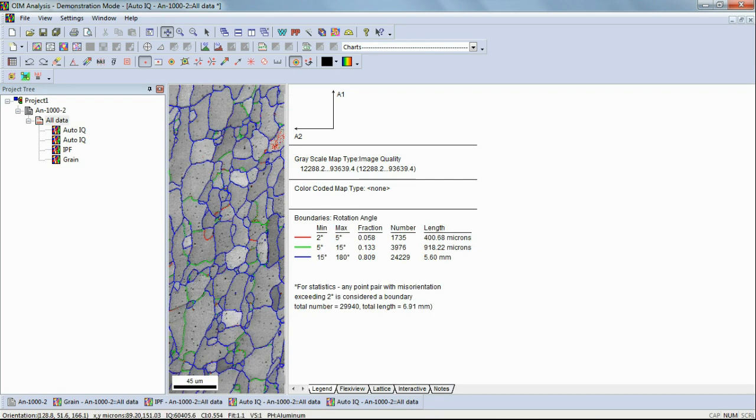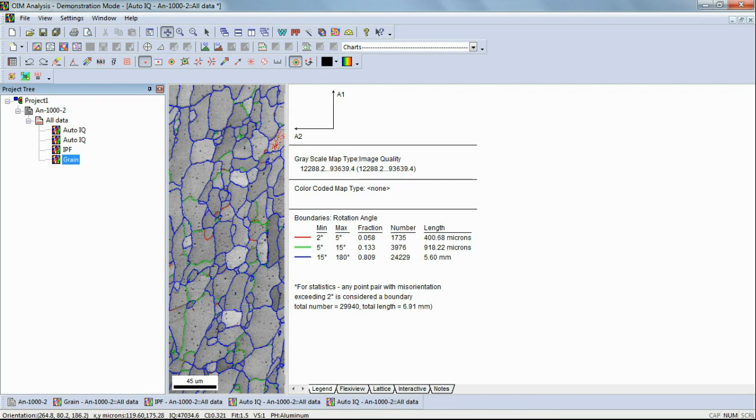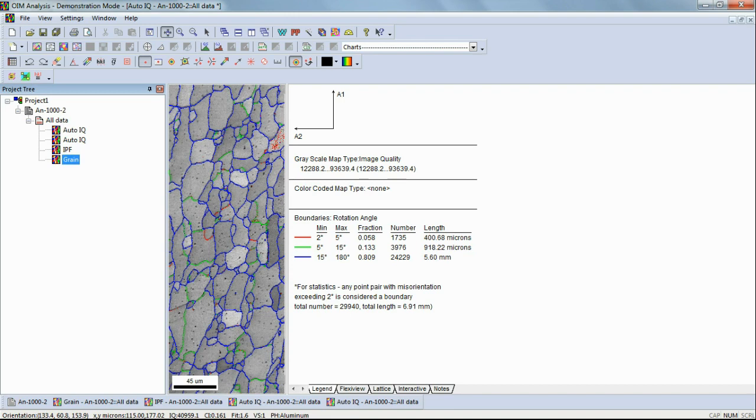From the top of the page, you can select and draw the boundaries map. In this map, the low and high angles grains boundaries are automatically displayed. Boundaries with 2 to 5 degrees of misorientation angle can be considered sub-grain structures.